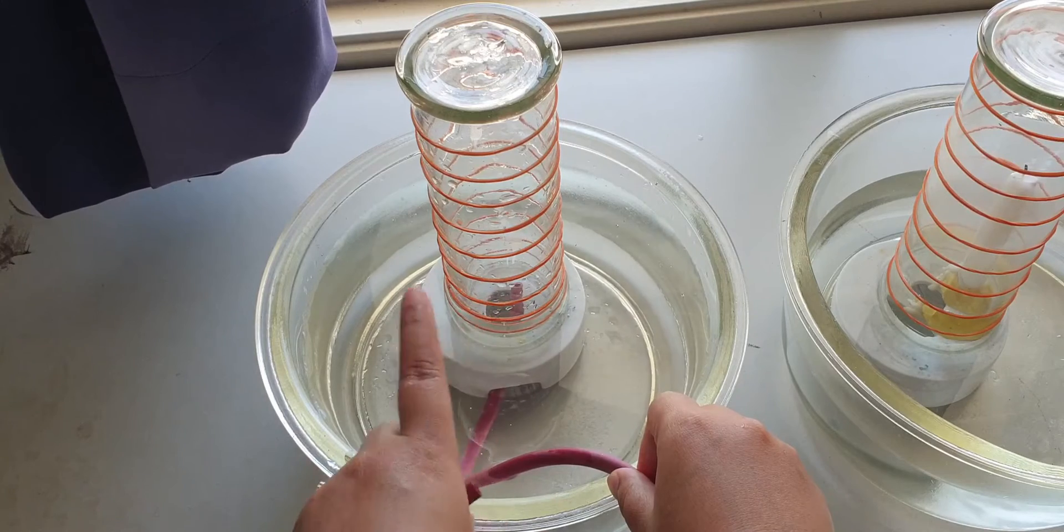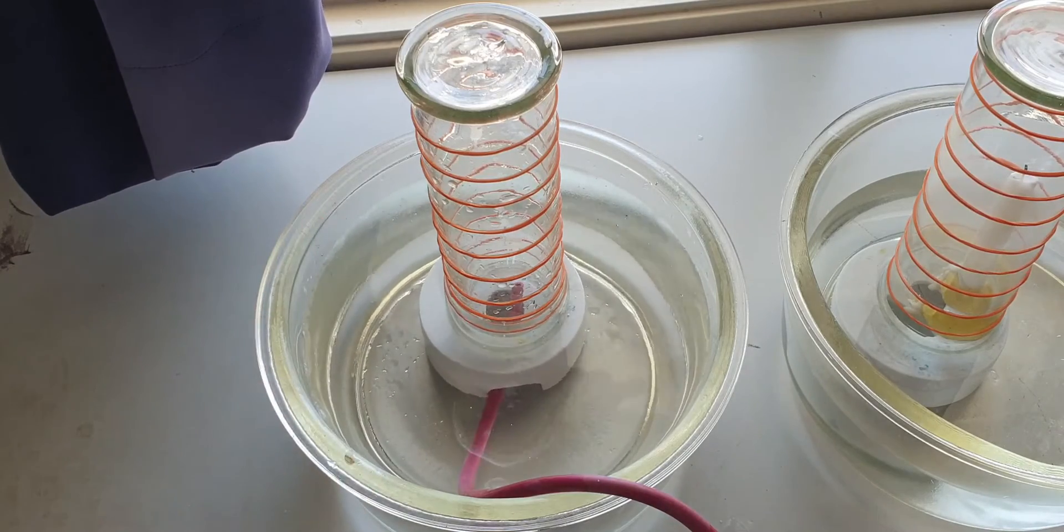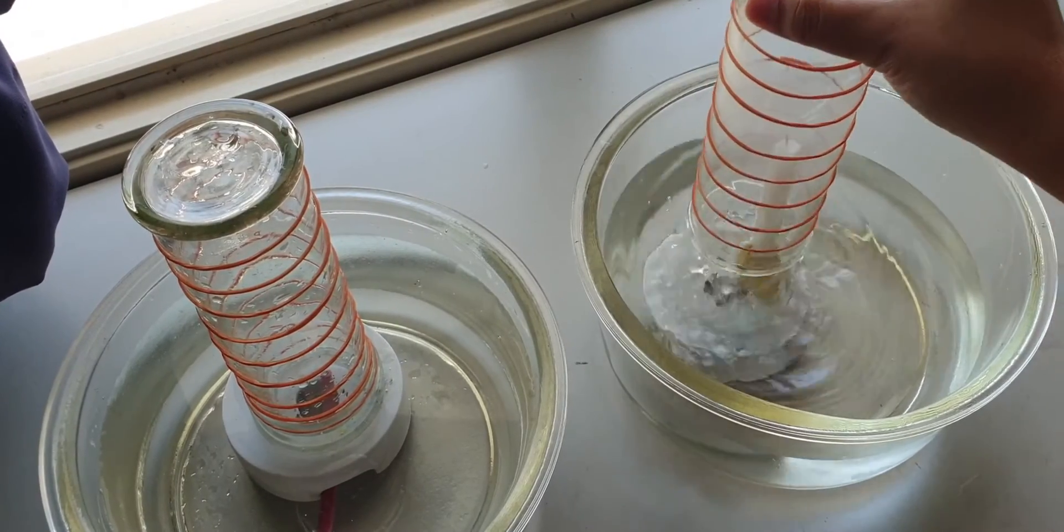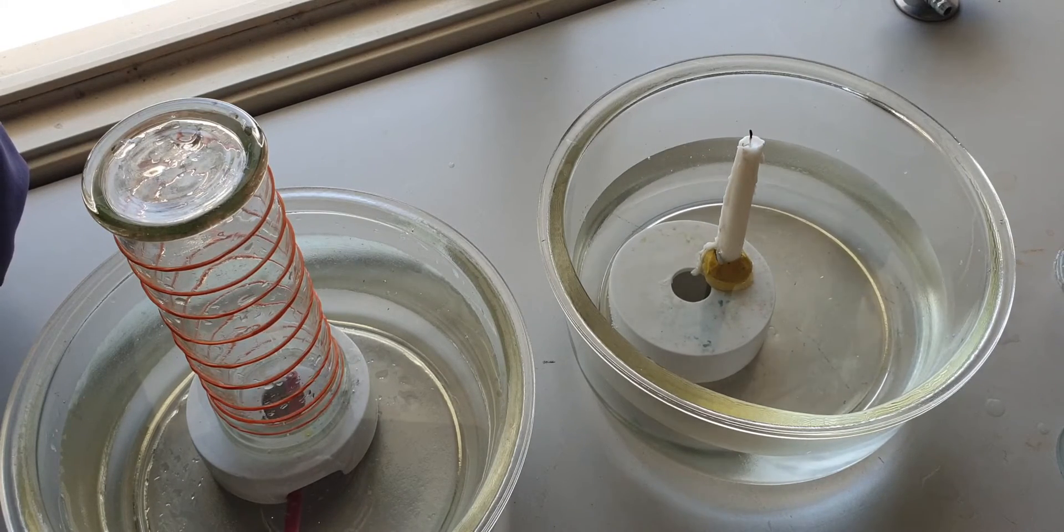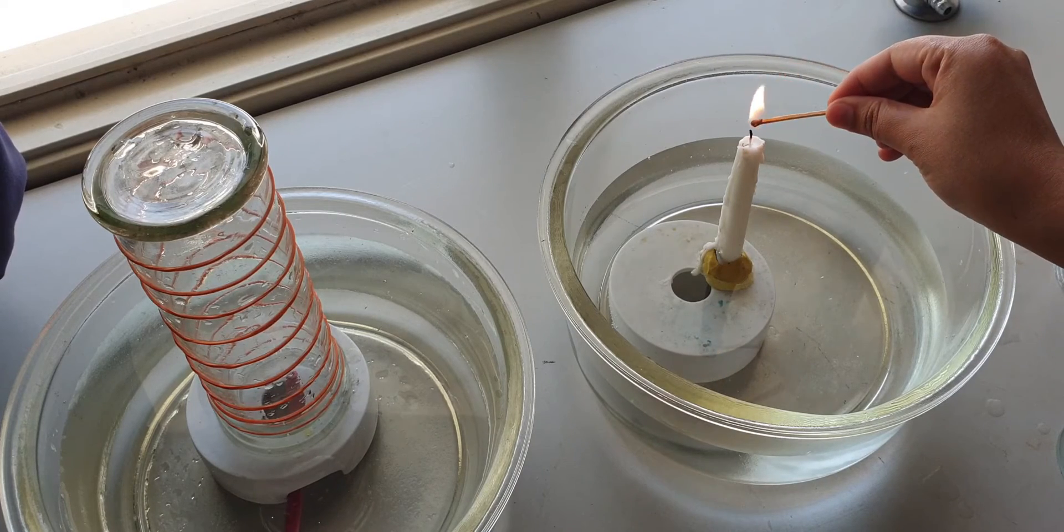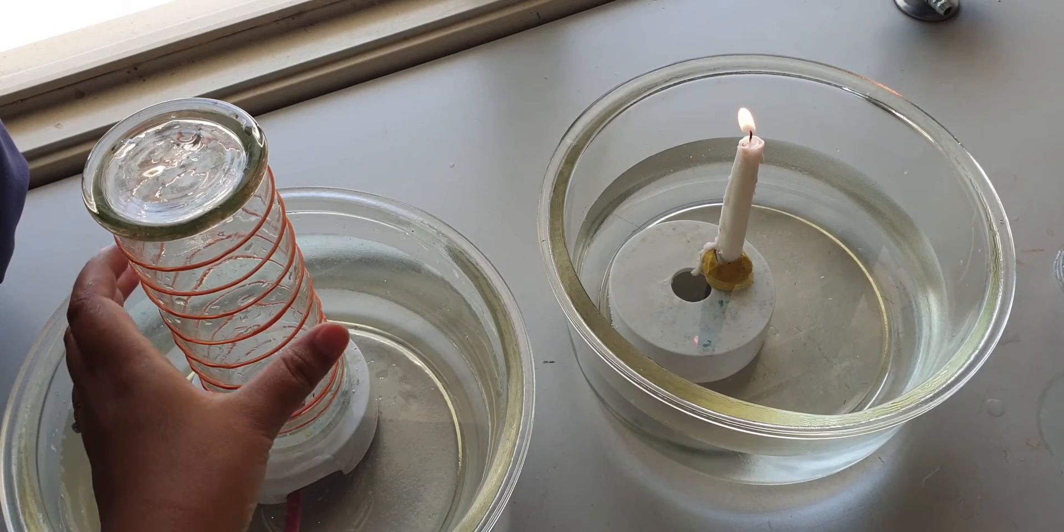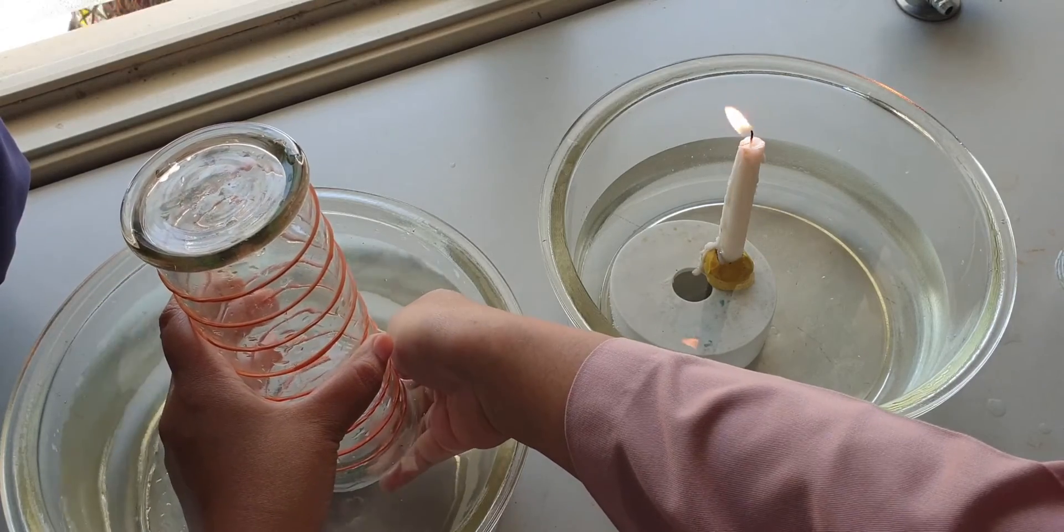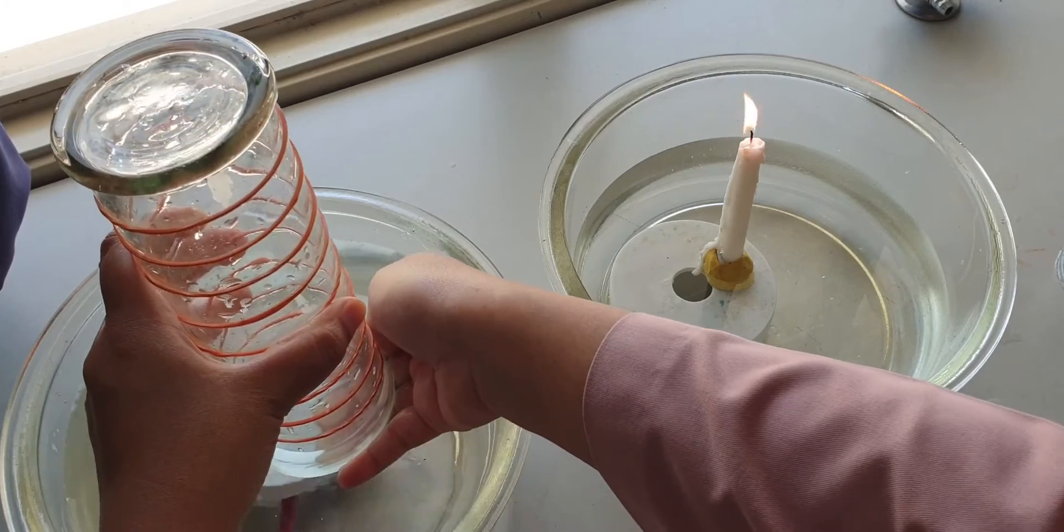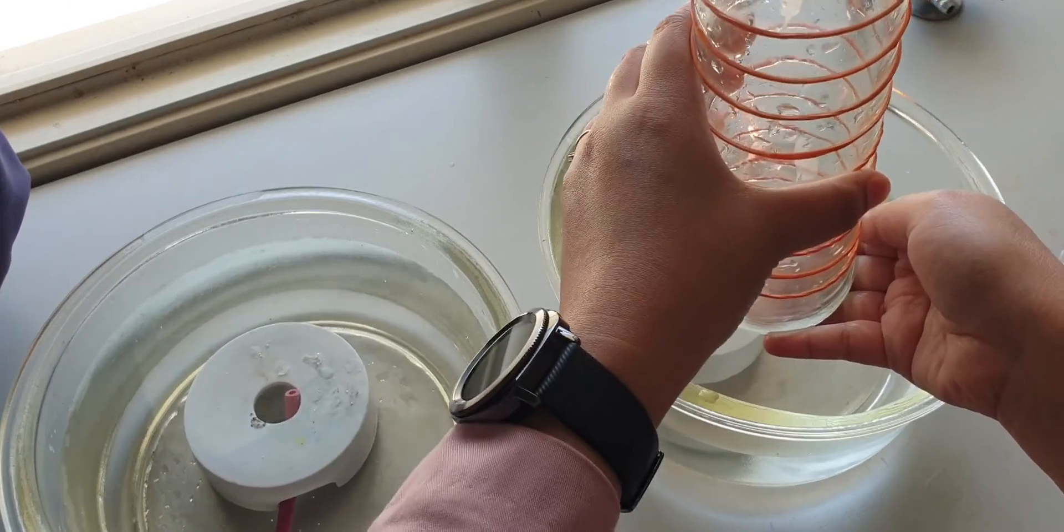That's it. The gas jar is already filled with exhaled air. What I'm going to do now is take this one out. I'm going to light up the candle again to test the oxygen level in the exhaled air. I'm going to carefully cover this up, take it out, remove the water, and carefully invert it onto the candle.